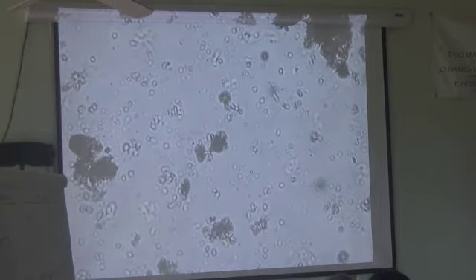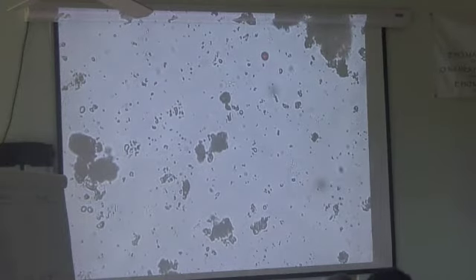So one flagellate has wandered by. Fungal spore, you can record them if you want, but we don't count them in our fungal determination, because we're interested in organisms that are doing something. So no, it's not part of total fungus.